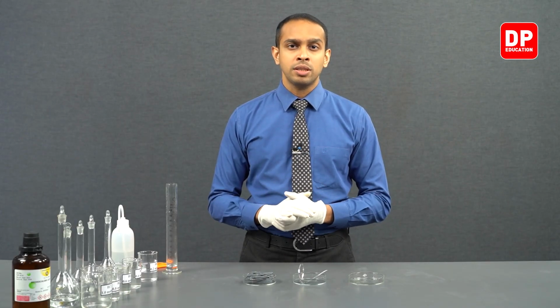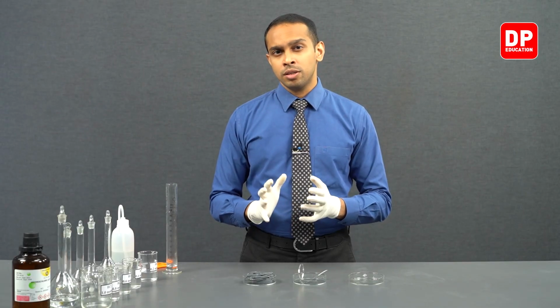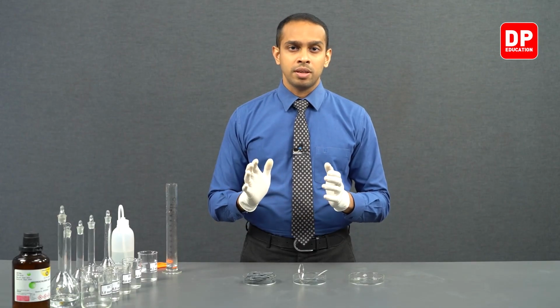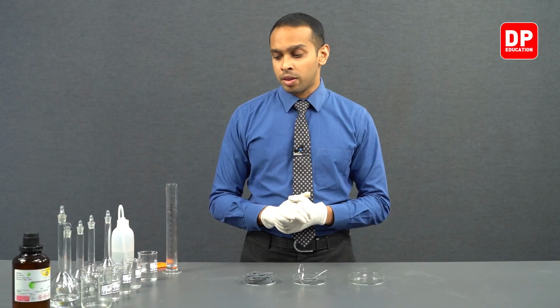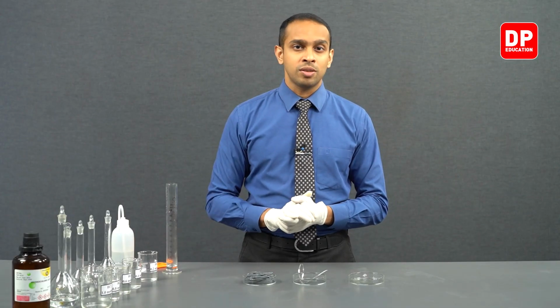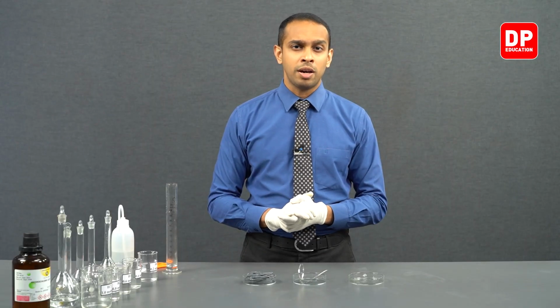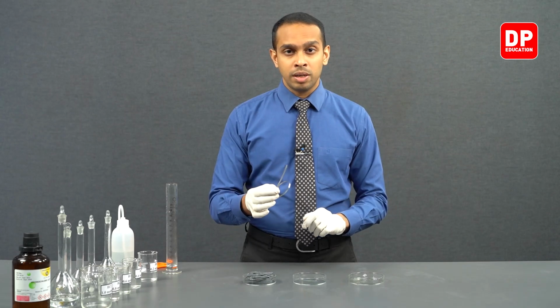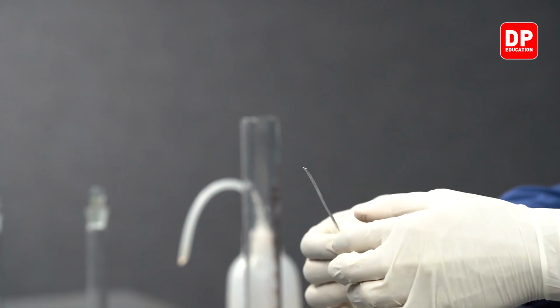And in this reaction, we are going to collect this colorless gas, and to make sure that we keep everything in this particular experiment series a constant, other than changing the concentration, we want to keep everything else a constant. So therefore, we are going to take similarly sized magnesium pieces for this experiment.